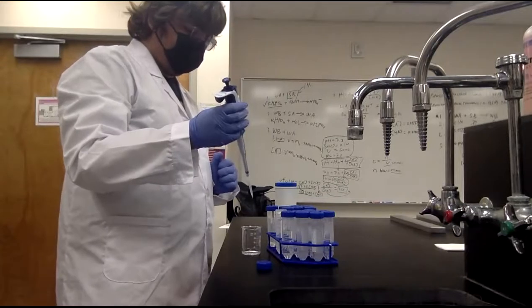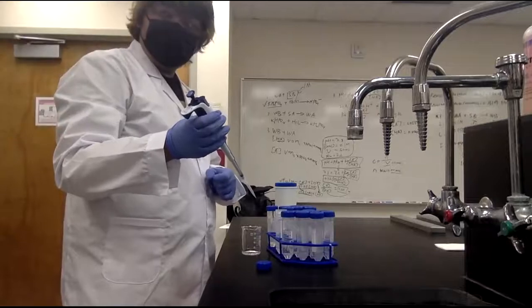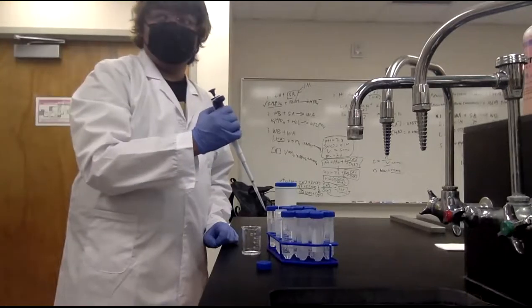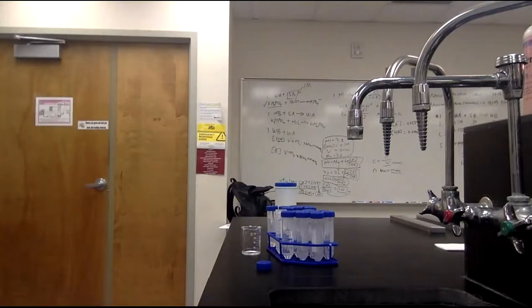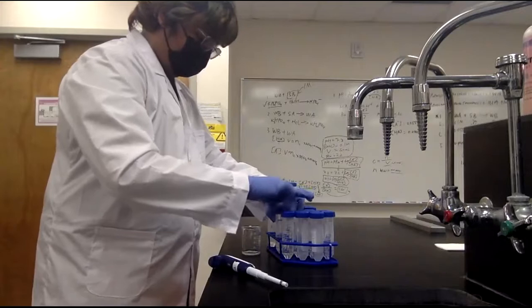We toss this away. I mean, we'll be using the exact same solution again, right? So do we toss the pipette away? Have you finished the 800? Yeah, I have. So you just toss it away. I mean, we'll be using more sodium hydroxide. Will we? I guess we won't. Okay, yeah. You won't. The tips are cheap, so you don't have to worry about wasting too many tips. That's because we need to react with the air.